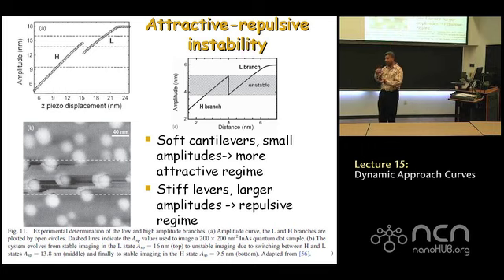So what is happening is, you've chosen an oscillation state where initially you are in the attractive regime, right? And then as soon as you went over the bump, there was a perturbation and the controller got confused and it went into the repulsive state, which means it brought the Z down further, right? Pressing down further to get the same amplitude, right? So if the Z goes down further, it means, and remember, what you're rendering is the amount the Z had to go up and down to maintain the constant amplitude. You suddenly are creating this artifact of a darker, deeper region, when in fact all you've done is the Z is pushing down more, because the oscillation state is now in the repulsive regime.